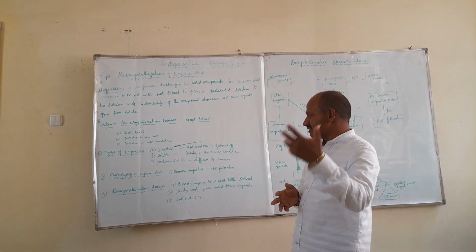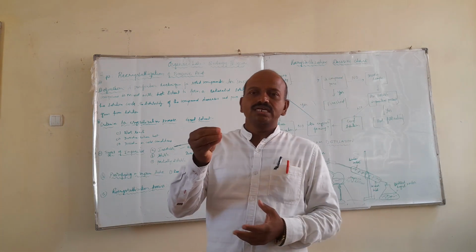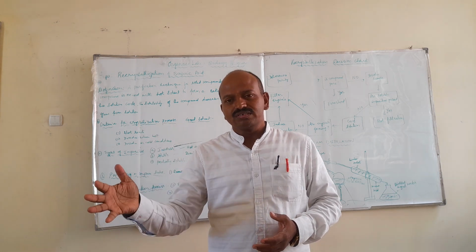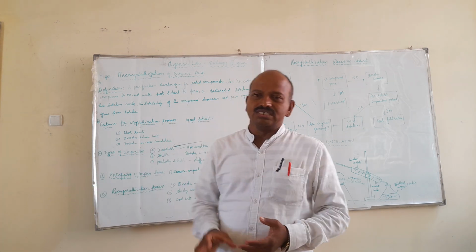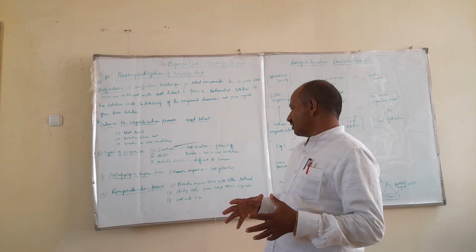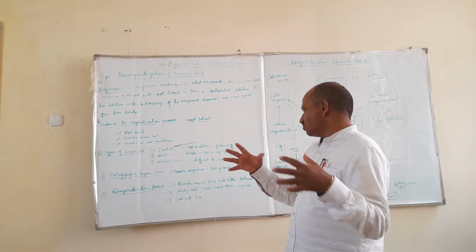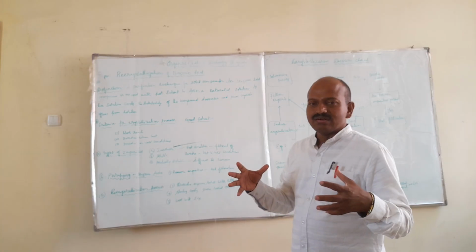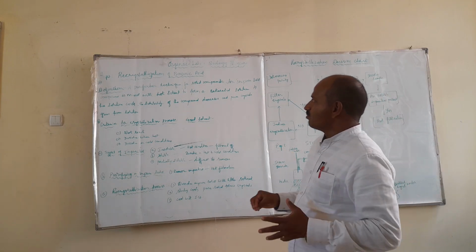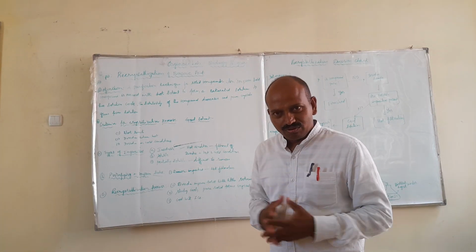In the recrystallization process, we dissolve the solid in a little solvent. We take the compound to be purified and mix it with the solvent in hot condition. A very little amount is needed, not more. After that, slowly cool it using ice crystals, and it separately forms pure crystals. This is the introduction to the basic subject of recrystallization of organic compounds.